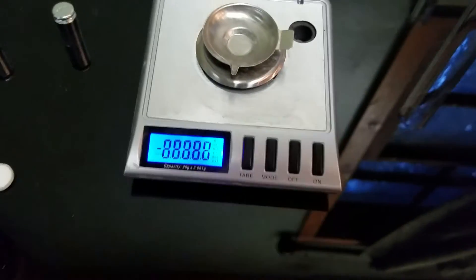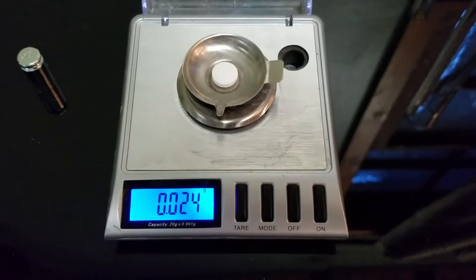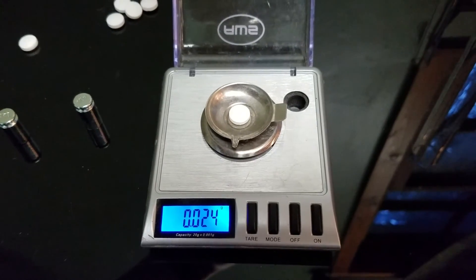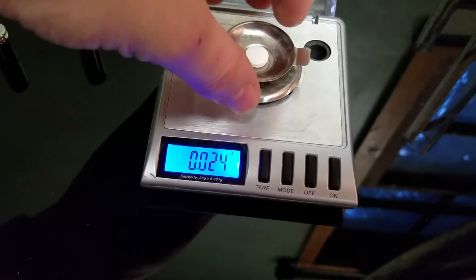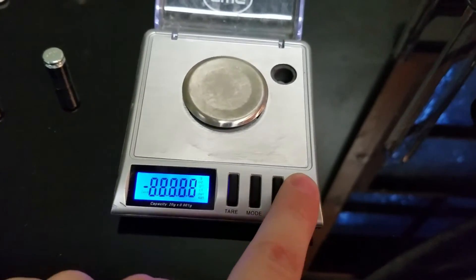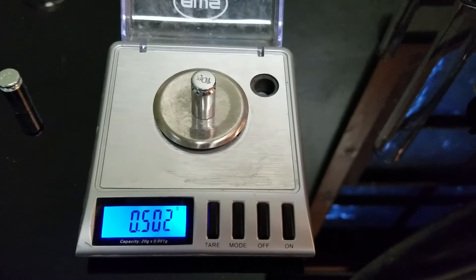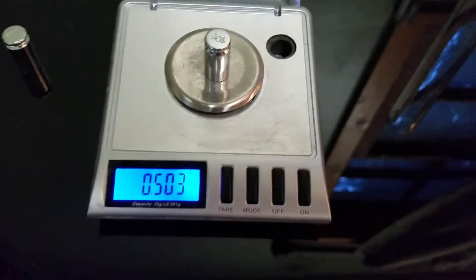Let's turn it off and use the weighing tray, just to make sure. Turn it on — zero grams. Place our tablet: 0.025. These are supposed to be 325 milligrams, so that's not right. That can't be correct. Let's remove it. We're going to tare it again, turn it off, turn it on. 10 gram weight — 0.5. That can't be correct. Obviously, this scale does not function either.